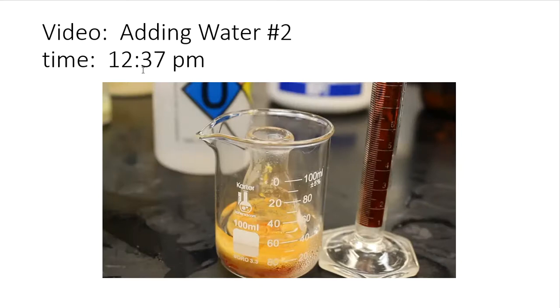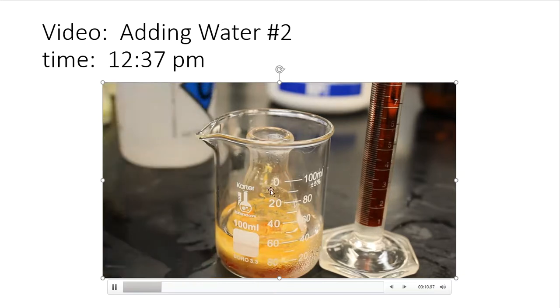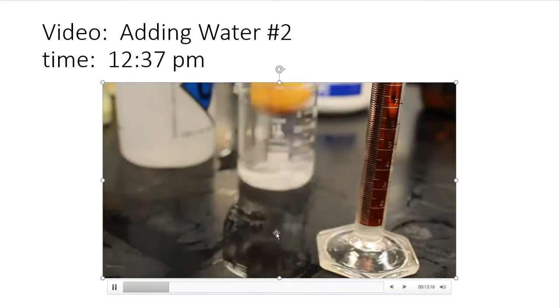All right, so here's video number 2. We're going to add water to it as well. This one's going to happen at 12:37 in the afternoon. And this is the methyl hydroxy blah, blah, blah. All right, so here we go. 10 more mils of water added to the side. And I'm going to add that water to that nitrating product right there.